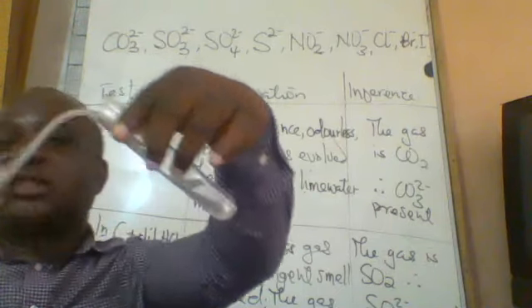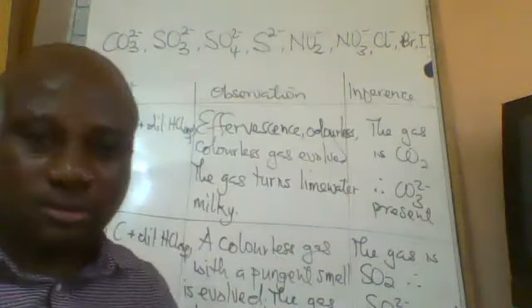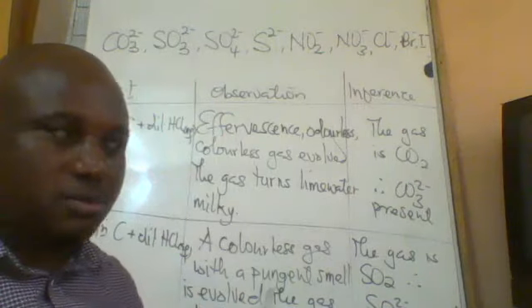Aha. So the gas is bubbled through it. That's the meaning. Oh, okay, sir. Thank you. Yeah.